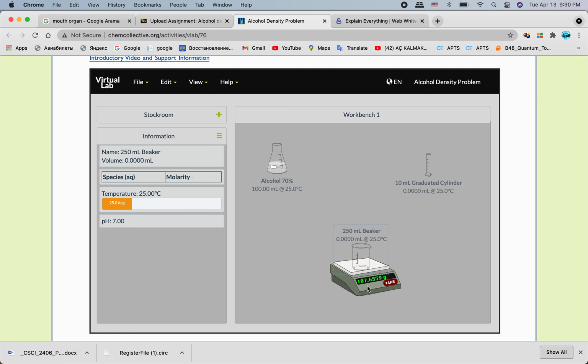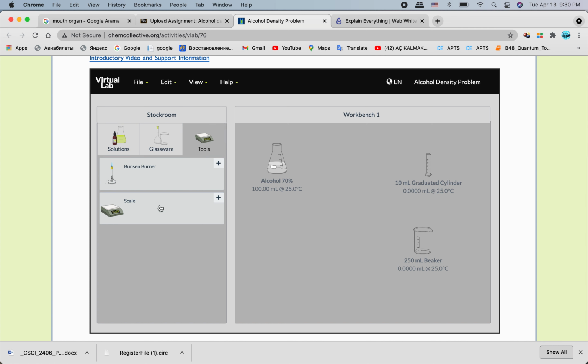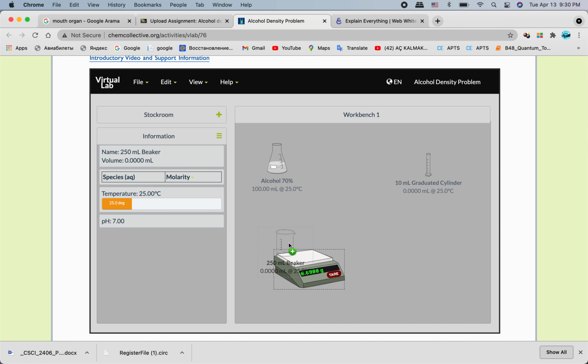I don't understand why it doesn't work. It does not work. All right, let me try one more time. Okay, it happened in lesson 2. Let me remove it and scale again, and try again. Here we go. It should be okay now.